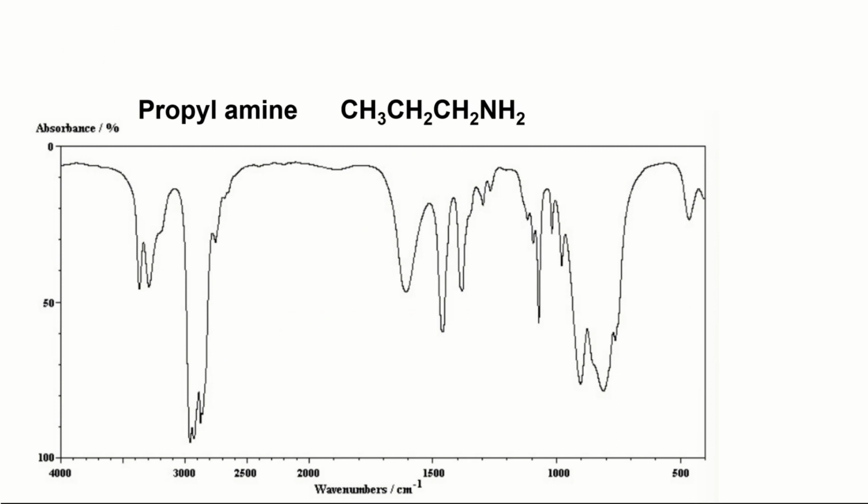Another example is propylamine. I have the molecular formula as well. If you have the molecular formula, it's going to be very easy for you to determine all the peaks because you know what kind of bonds are present in the molecule. I have the information over here as well.